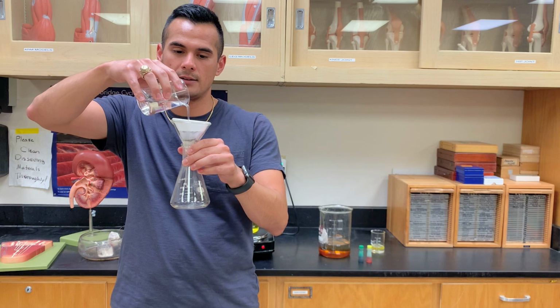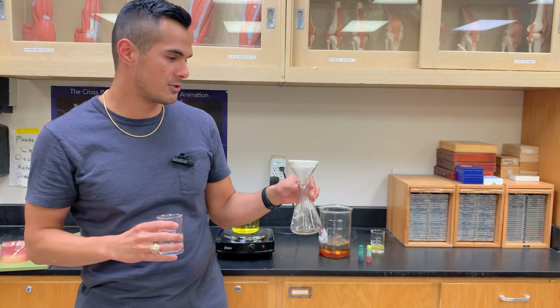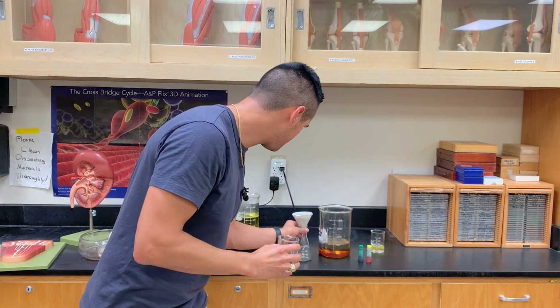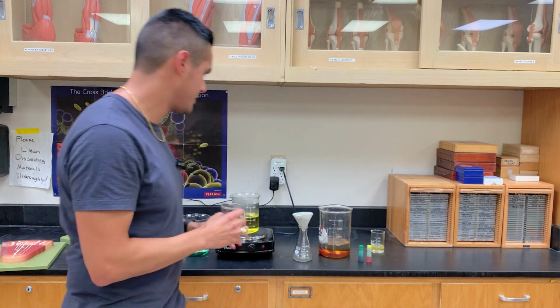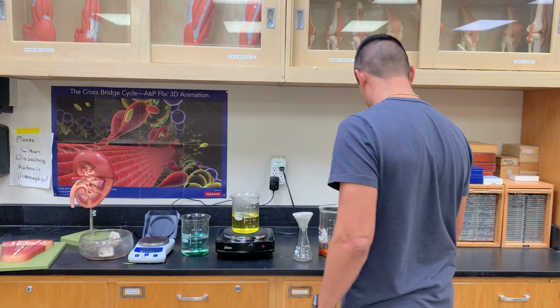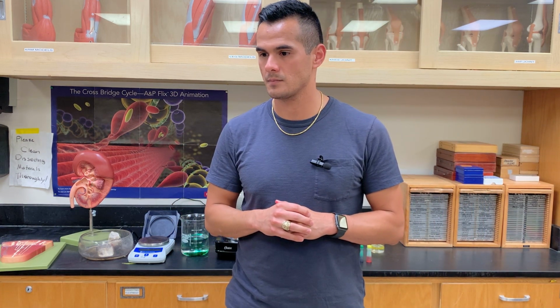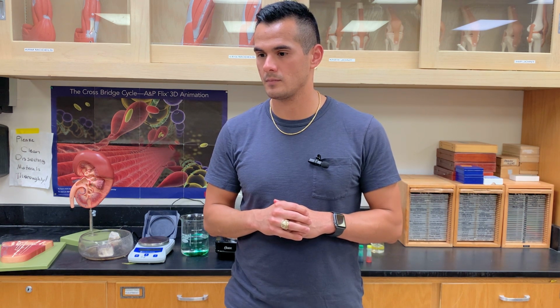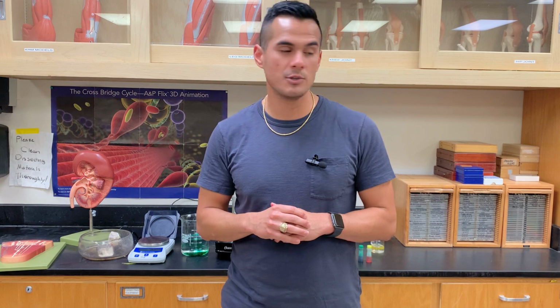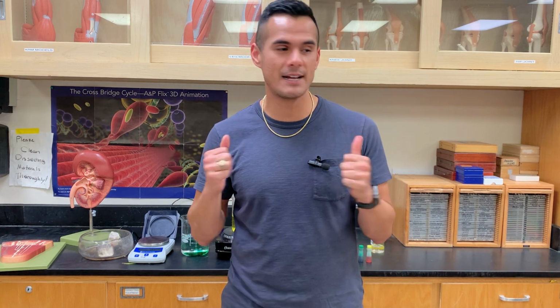Just go ahead and add it, and you'll see once you start to fill it to the top, right, all that potential energy is being converted into kinetic energy. Let me turn this on. So we'll just let it slowly drip here. Are there any questions for me? No. Okay. All right. So that's it for this lecture.